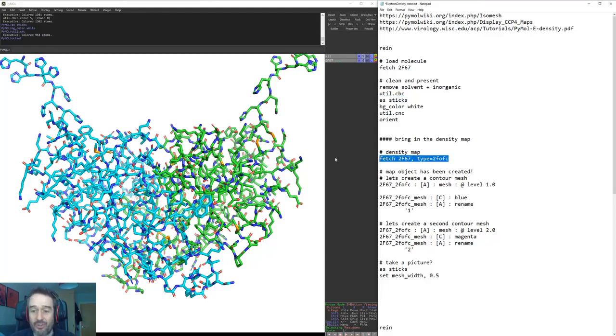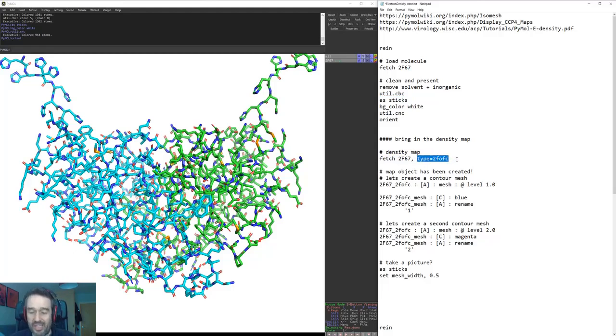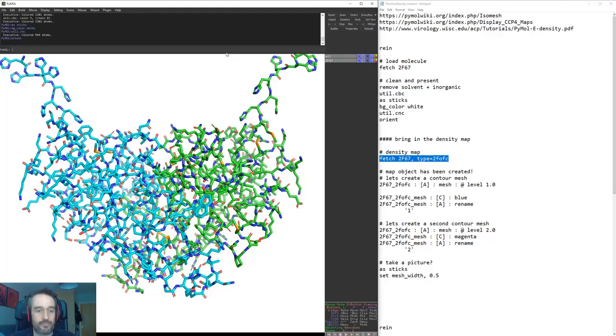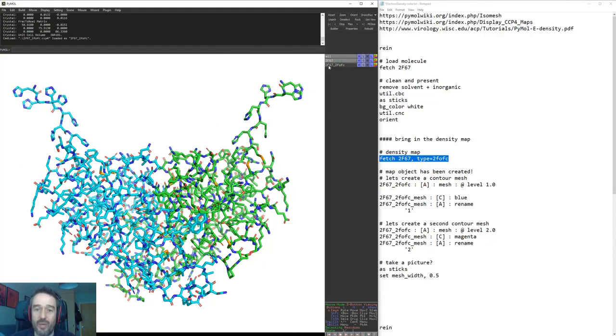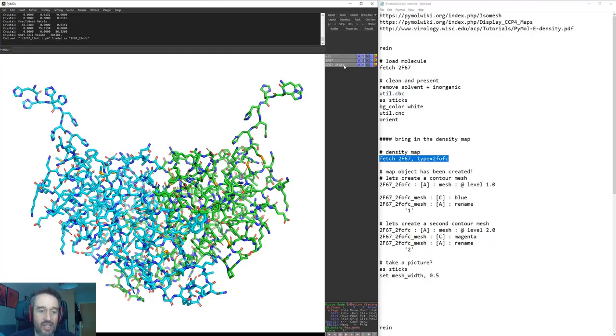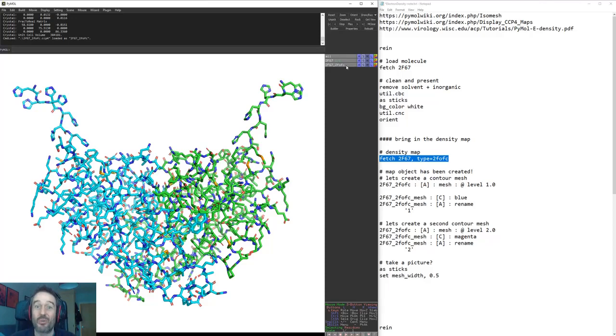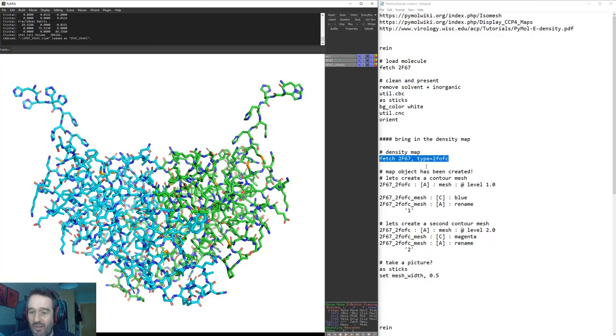Sticks is a more appropriate view when looking at electron density. So then we can input our electron density just by adding this little guy here, type equals 2FOFC, at the end of our fetch command. That will bring in a new object here, 2F67 underscore 2FOFC. Now that object has nothing on it when we click on it because it's a density map. We need to contour that density in such a way that we can look at various different levels of it.